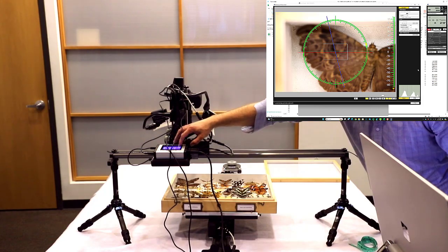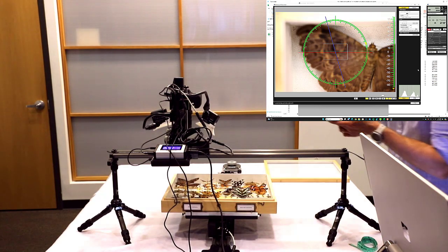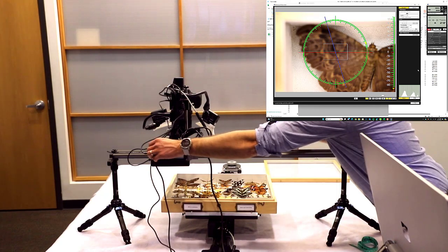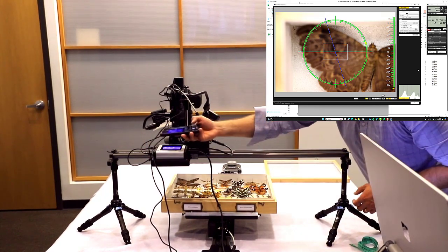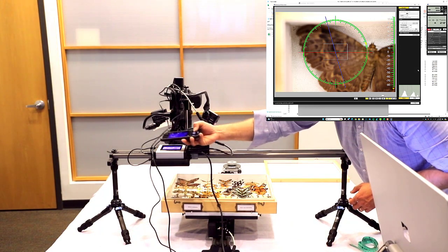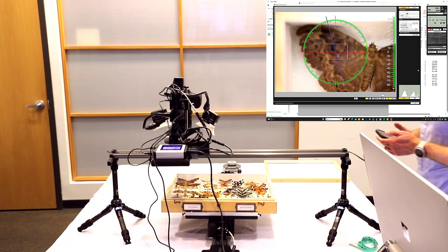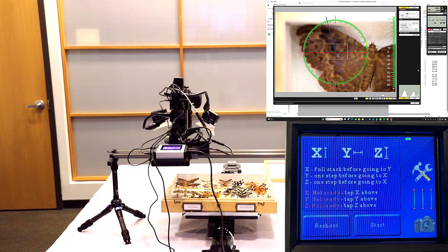Right there. And these are basically going to be all of our starting points. So right off the gate, you can see none of my axes are actually configured at the moment. What I'll do is I'll take a picture of the screen. The system is going to ship in this mode. It's basically an XYZ panoramic stacking mode. So it's going to be already set to this screen, but I will show everybody how to get to this screen if needed. So what we're going to do now is we're going to click on that X.